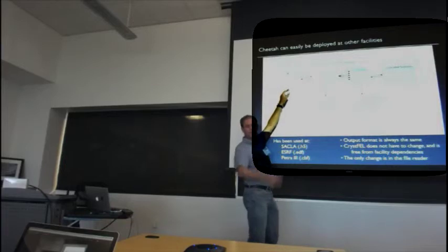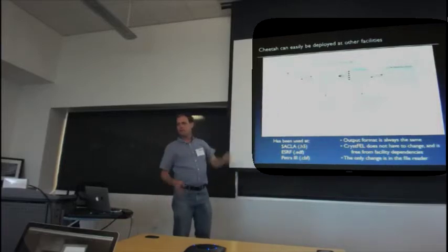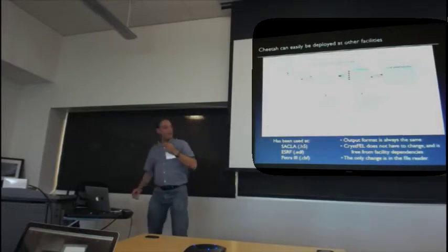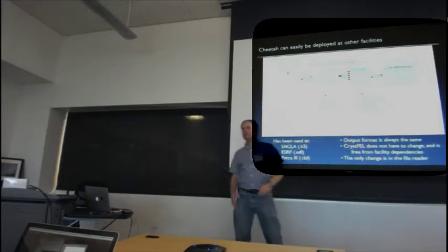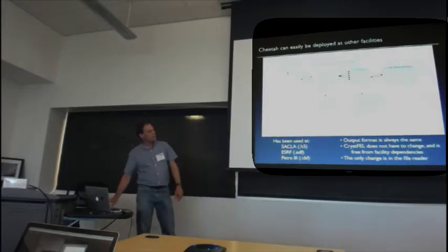It also means, for example, that Tom went to ESRF to process some data, and it took a couple of hours just to write a new translator and reader to be able to run Cheetah on the data collected at ESRF. And it also means that then the output format is the same. So the same HDF5 output format that I spit out at LCLS would be the same at any of these other facilities. So now CrystFEL does not have to be completely rewritten for each facility.